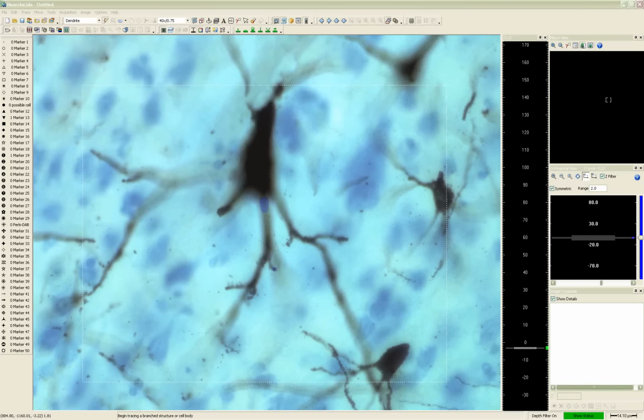It's a possibility that you have slop in the turret for your lenses, which means that as you switch from position to position on the nose piece, the turret for the lenses doesn't seat in the same exact spot from switching to switching. There's not a whole lot you can do about that except get very good at aligning your structure. That is nothing to do with Neurolucida. It's an issue with your microscope.